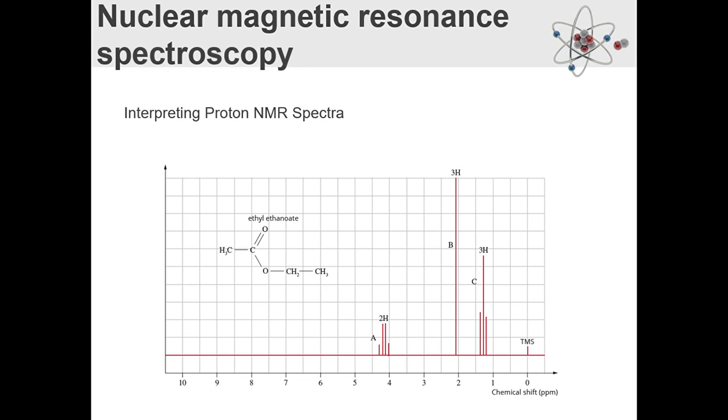All right, welcome back. Now, let's look at the easiest piece of information that we have. We have a singlet. A singlet means that there are no hydrogens within 3 steps. So which hydrogen environment would that be? Well, B would become this CH3 group here in the ethyl ethanoate because there are no hydrogens for 1, 2, 3, 4, 5, 6 bonds. Hence why it's a singlet.